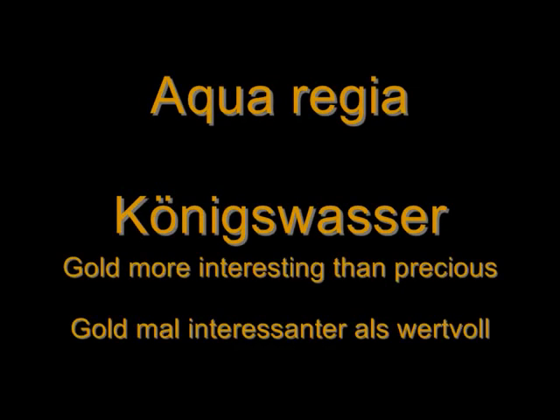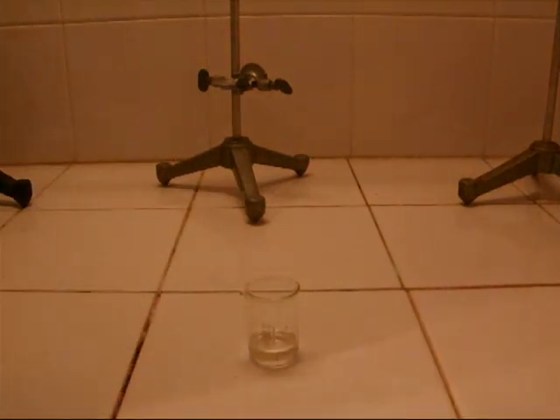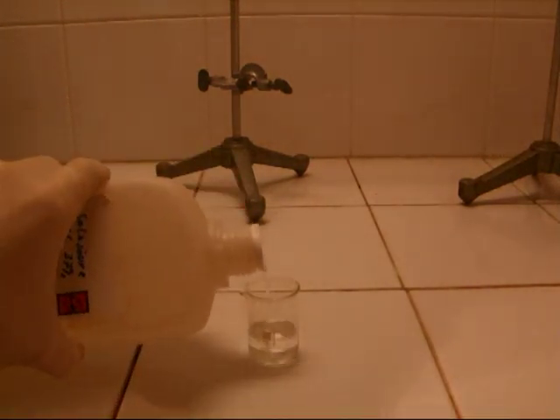Aqua regia. Experimenting with gold. At first, nitric acid and hydrochloric acid are mixed together to form aqua regia.